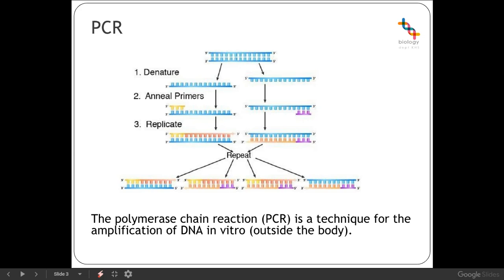Now, it's particularly important to be aware that we are not usually, when we carry out a PCR, looking to copy the entire molecule of DNA that's inside the cell. Normally we're just trying to copy one particular section. It might be a specific gene that we're interested in researching. It might just be a particular area which tends to be quite different from person to person, if we're looking to do some identification or paternity testing. Or it might be looking for something really quite specific, and we'll look at that when we come on to some examples.